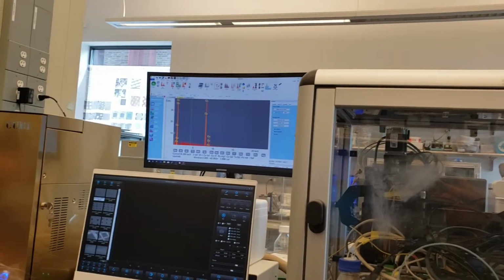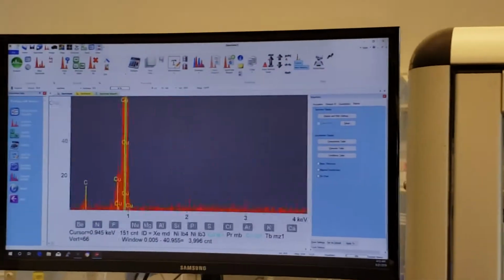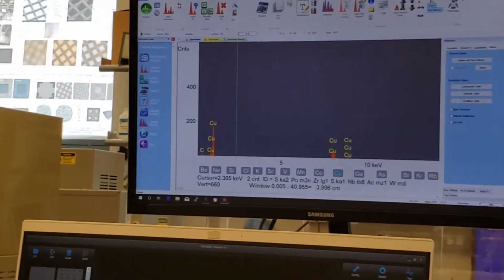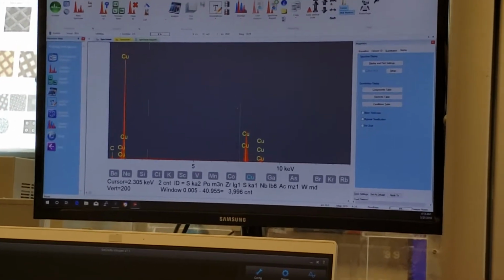So wherever you left click, it throws a cursor, and if I left click center that peak and drag to the right, it'll open up that peak, right? If I left click on here, it opens up this peak, for instance. If I have this all the way shrunk down and I go auto vertical scale, it'll scale to the highest peak, or it'll go down, up, shrink, separate, the old way of doing it, right?